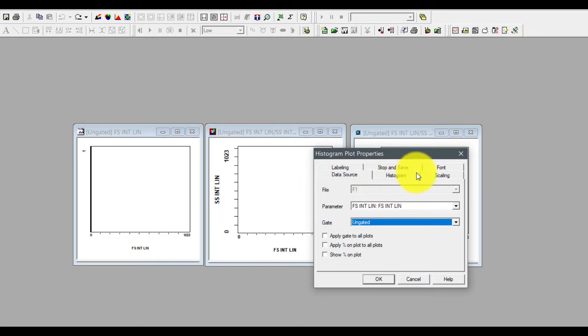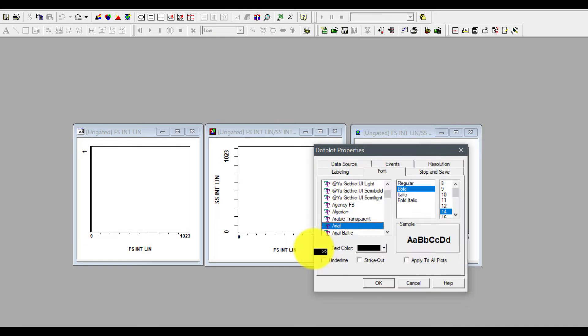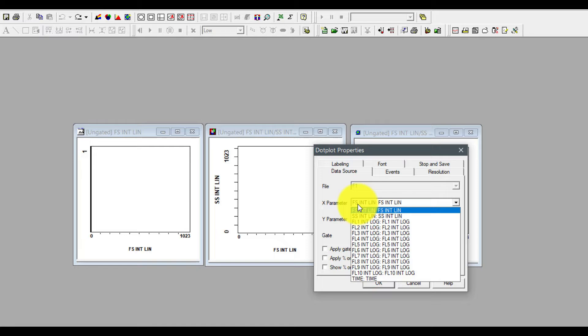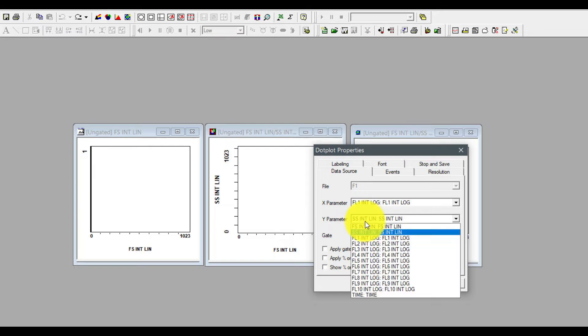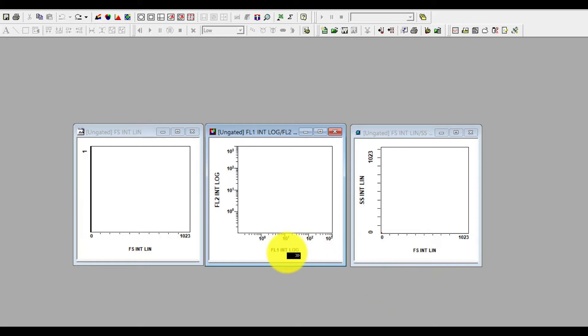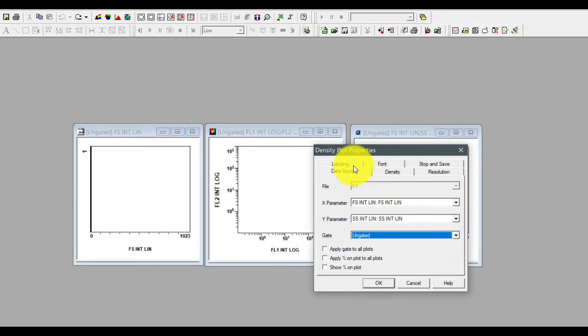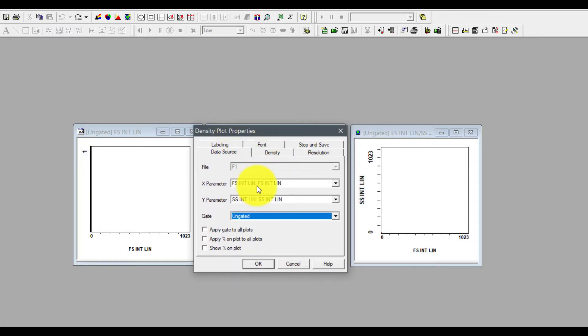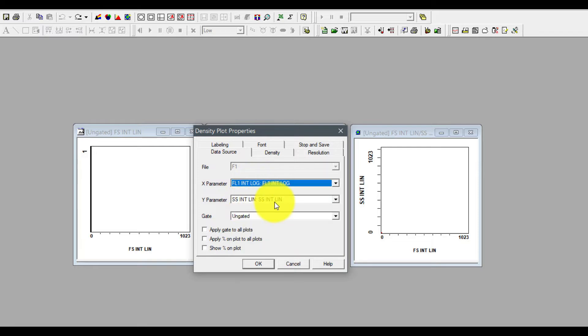Now select this plot, click here on the right side, go to data source. On the x parameter, click on it and change it to FL1, and y parameter change it to FL2. There is no gate right now, leave it. Once you press OK you can find that this is log scale, while the other plot is still in linear. So let's make it also to log scale. Go to x, check FL1 and y FL2, press OK.